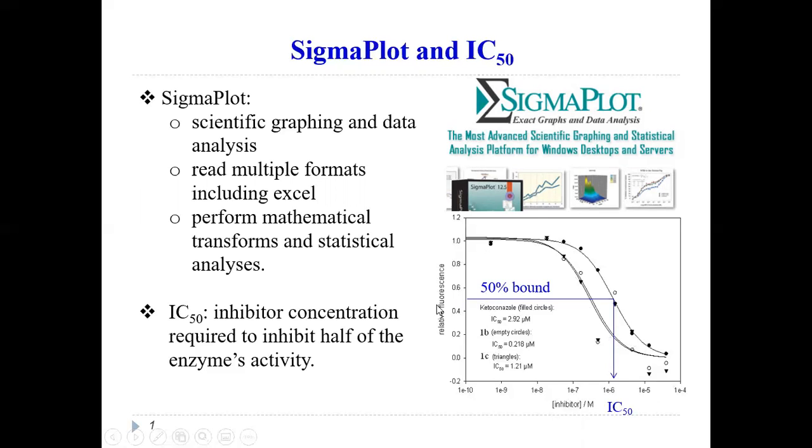What we're interested in is the IC50, the 50% concentration mark. The software does this for us, but it basically looks at the point where 50% of your fluorescence has been removed. So this is at exactly 0.5 relative fluorescence. Then it draws a straight line over to your graph and then straight down, and it tells you whatever concentration that should be, and that is your IC50 value. That concentration is the IC50.